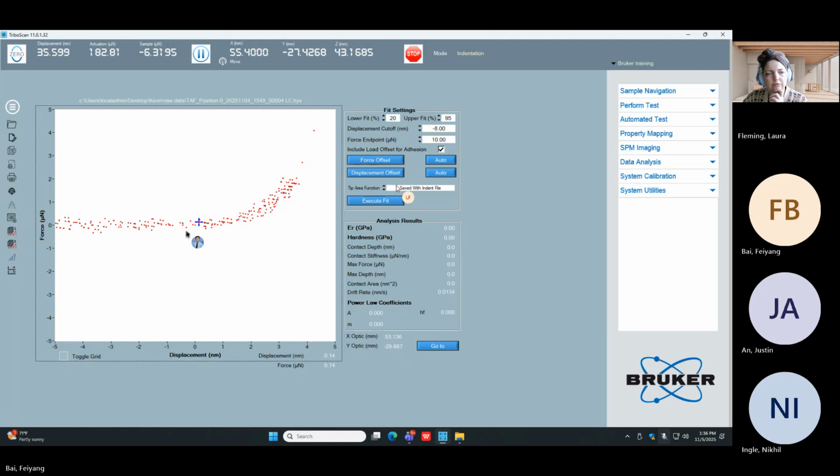Okay. Just a lot of work for 200 indents. So that's the batch Control G, is that only for this one? Correct. Only this one has been re-zeroed. If you go Control and arrows and look at the other ones, you can tell they have not been re-zeroed.